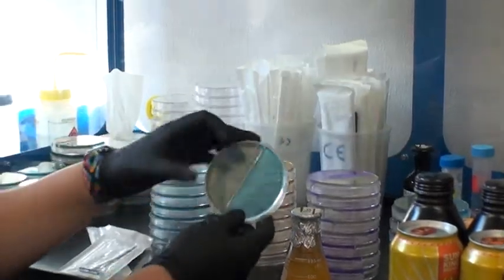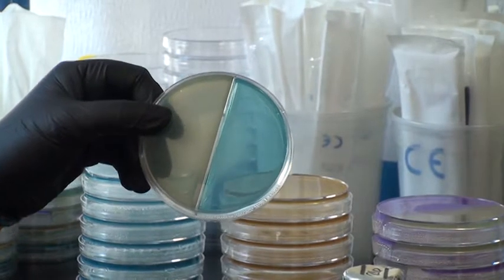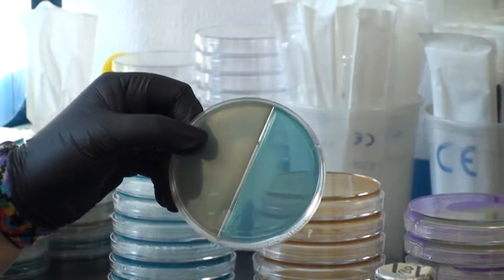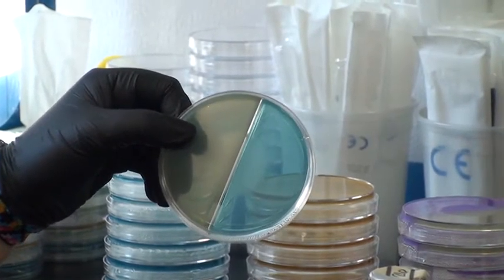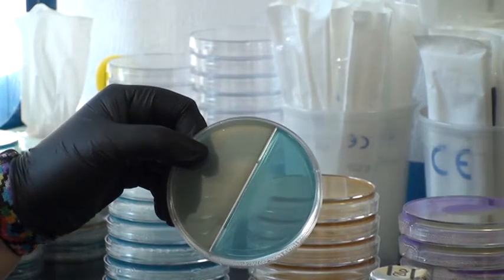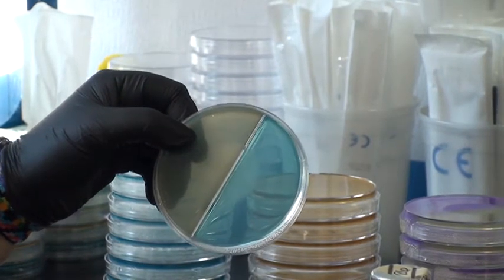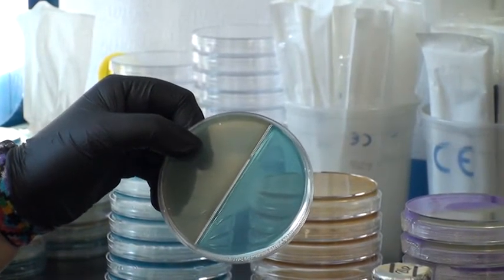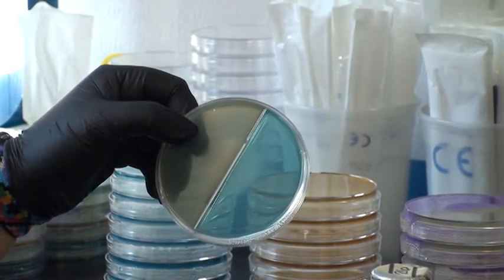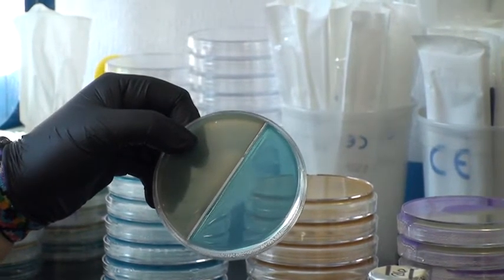Next is something we do just on Fridays. The greenish one is called FPDM — Farmer Pharmaceuticals Diastatic Media — and it just grows diastaticus, which has been a big problem in the brewing industry recently. We've had issues with it. This is an expensive media, so we only do it once a week, only on the beers that were brewed that week. Then next week when we're ready to pull yeast, we know there's no diastaticus in any of the yeast we're pulling.